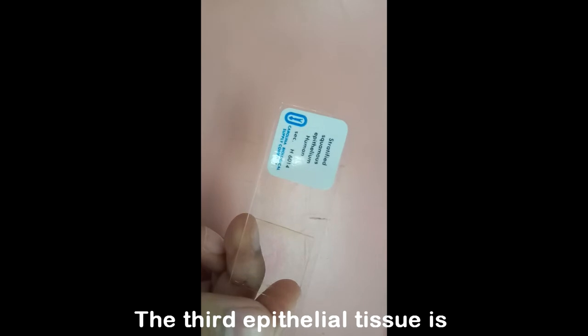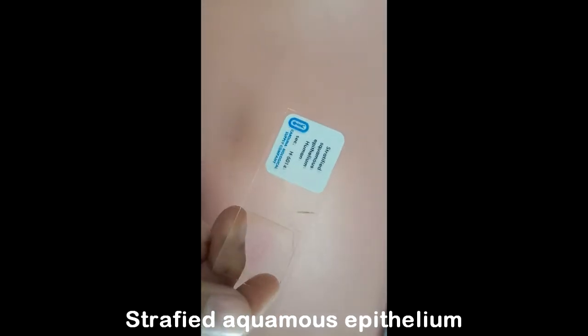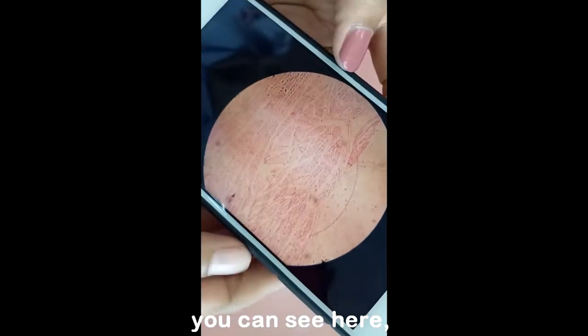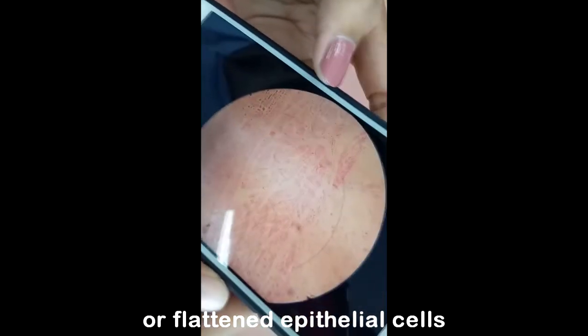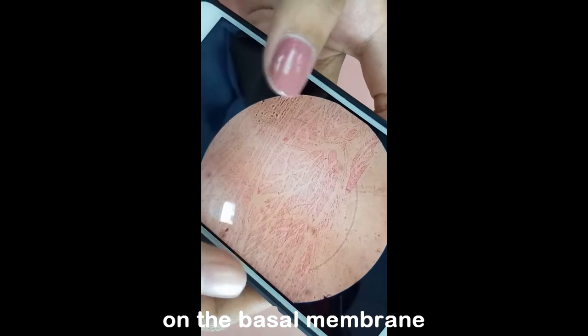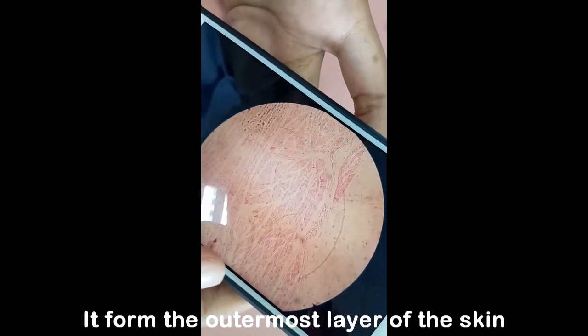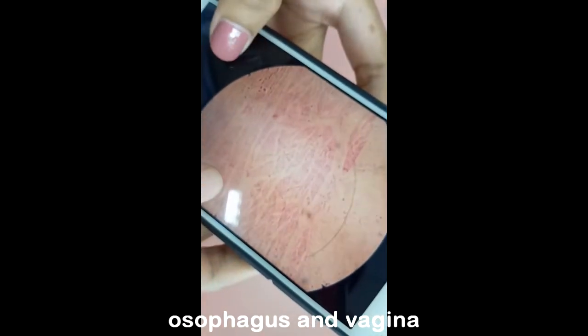Here, the third epithelial tissue is the stratified squamous epithelium, and after the observation we get this picture. As you can see here, it consists of squamous, or you can say flattened, epithelial cells arranged in layers, often on a basal membrane, and it forms the outermost layer of the skin and the inner lining of the mouth, esophagus, and the vagina.